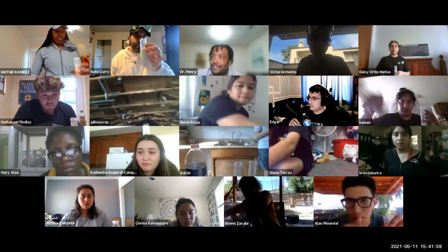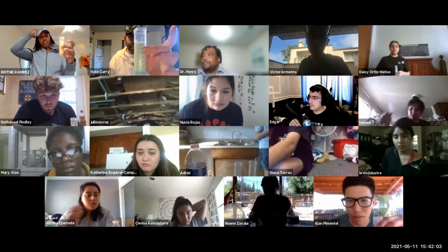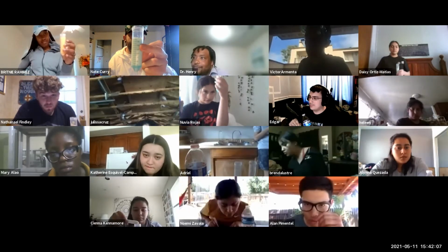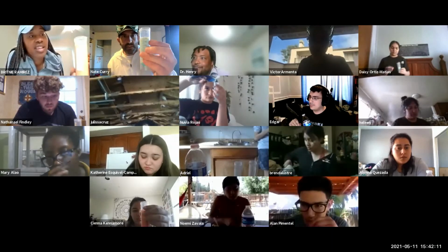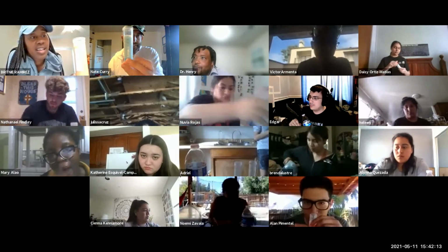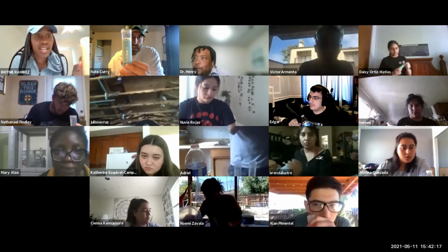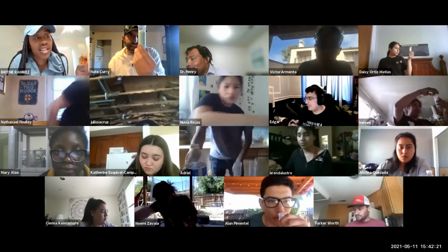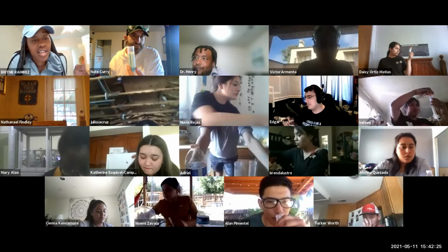All right, we're at 35. We hit 40. Now what? It's going slow. 41. Okay. So it stopped. So is that my number? That'll be your number. So where did it stop at? It's right in between 40 and 42 and a half. So I'm gonna say 41.